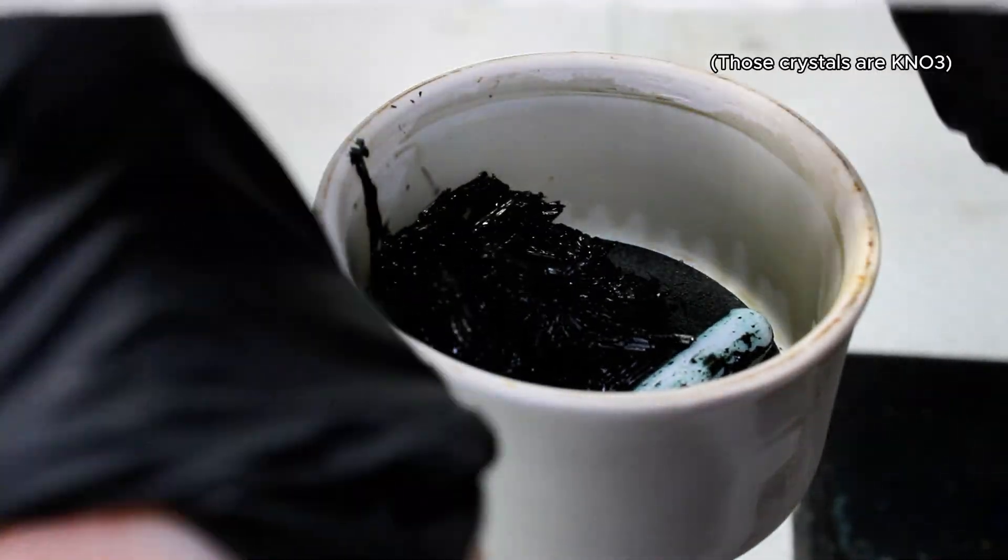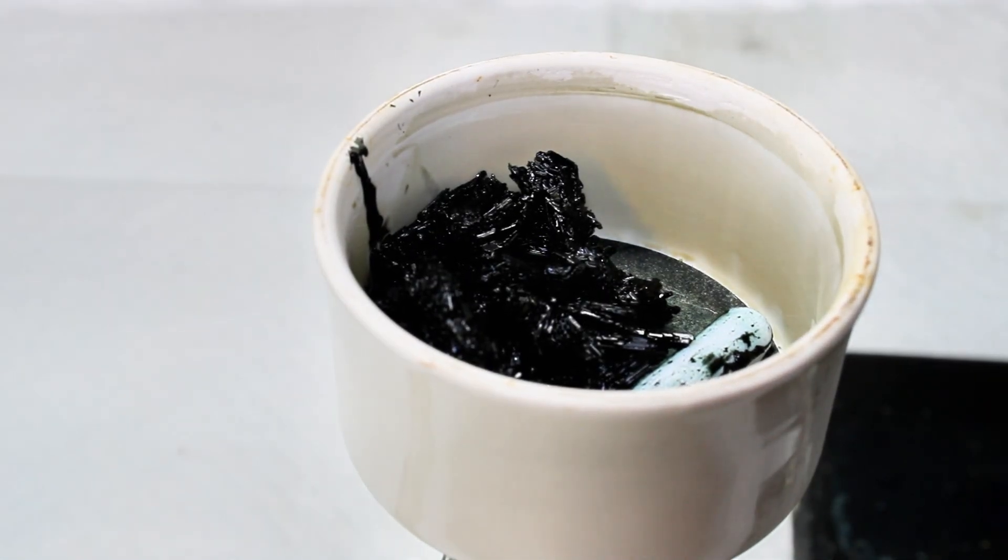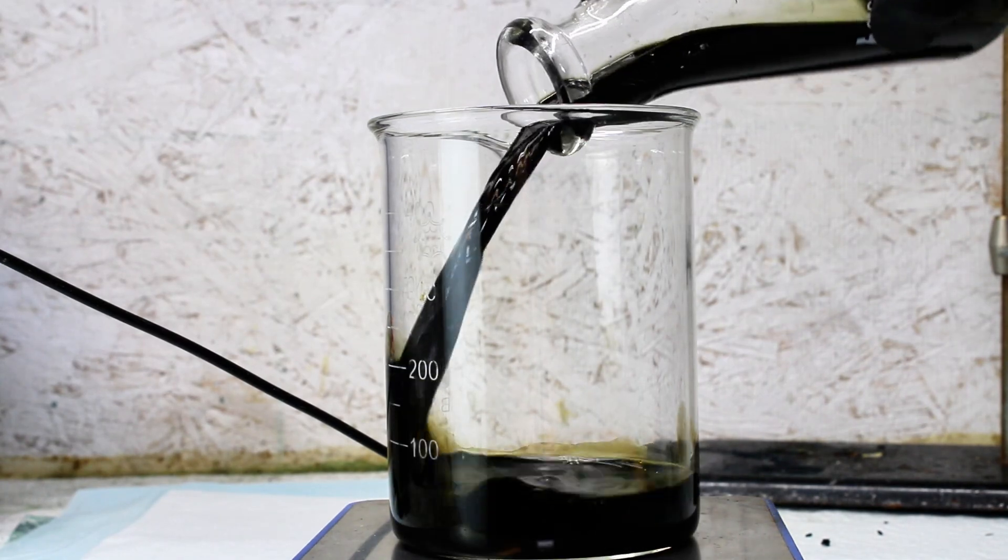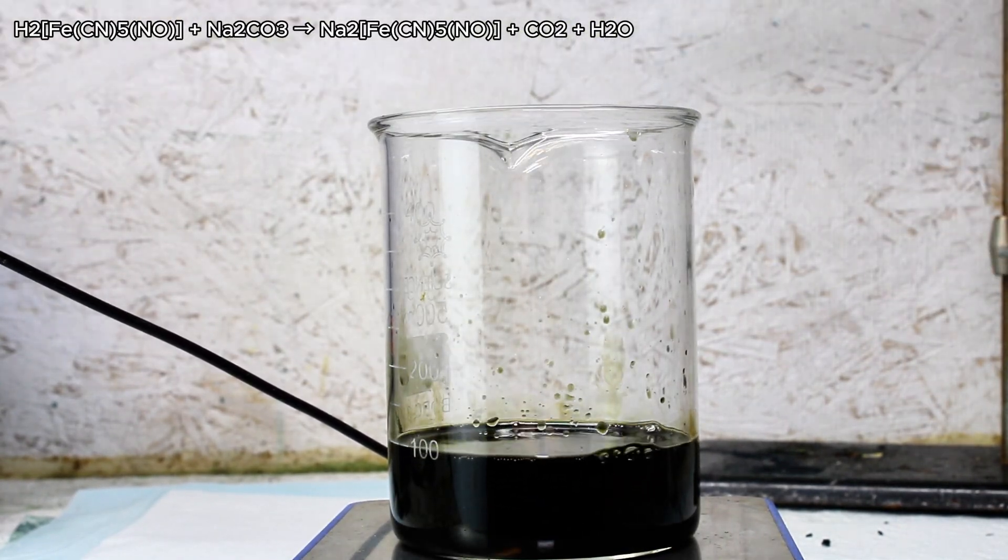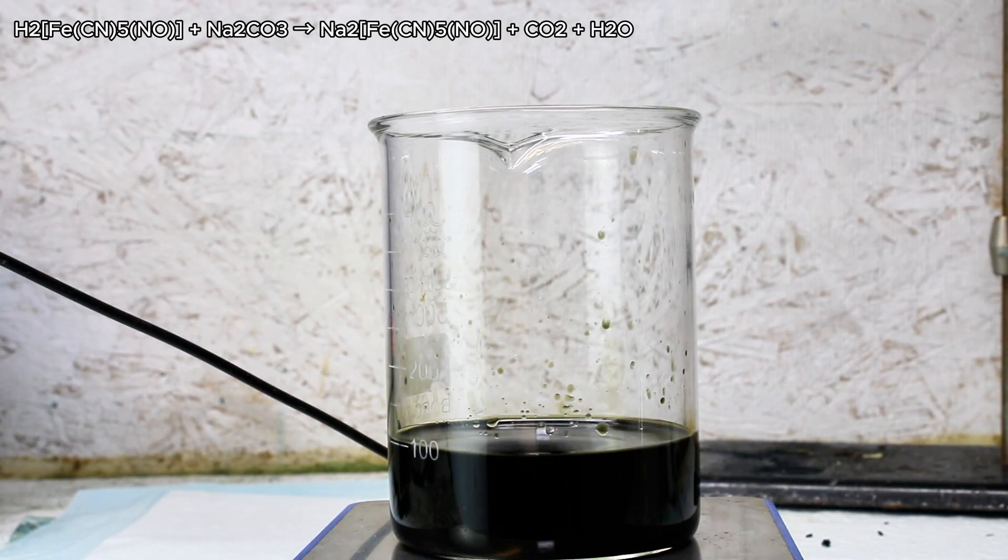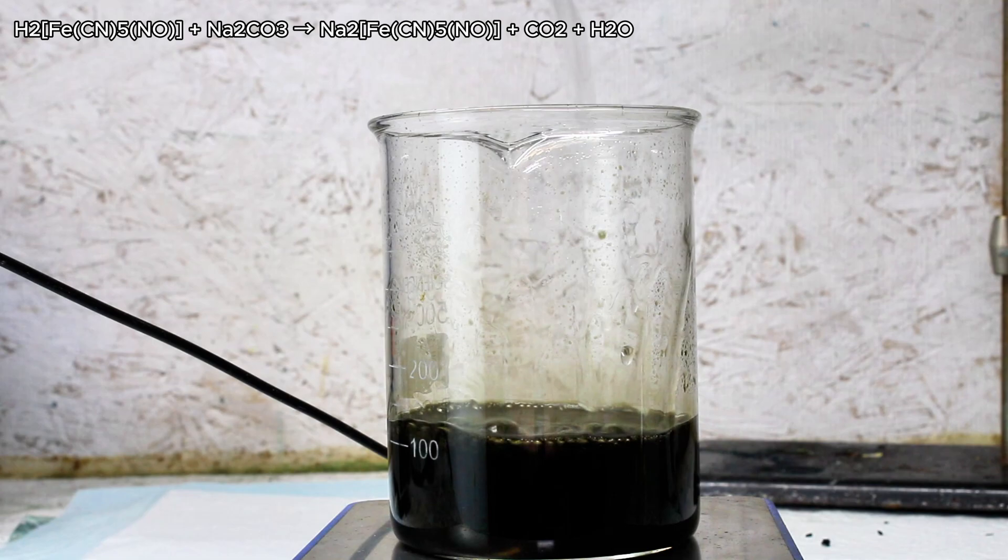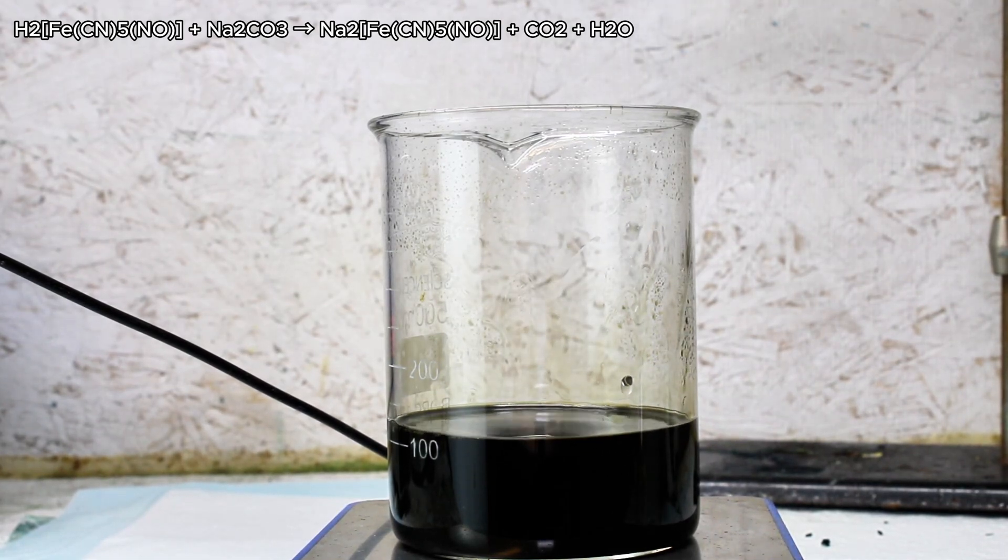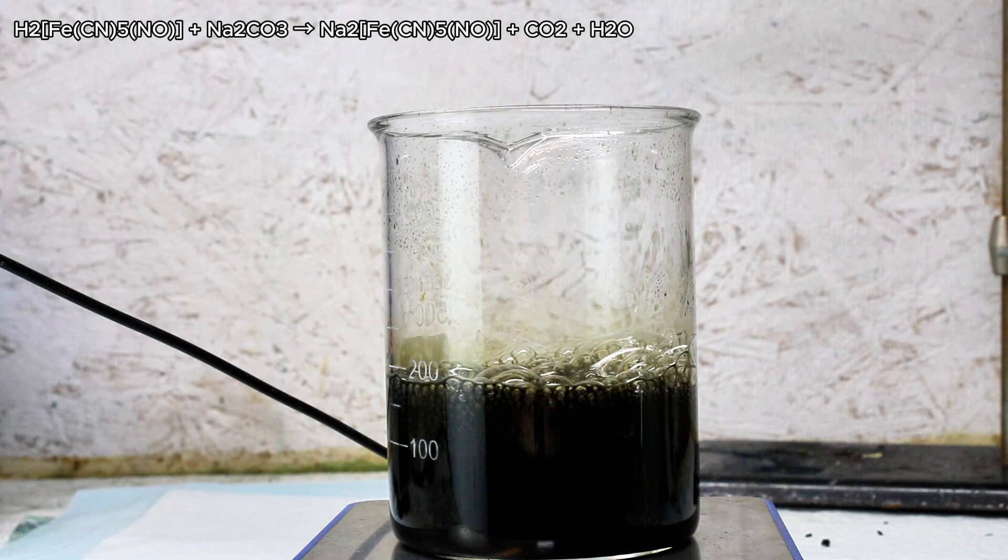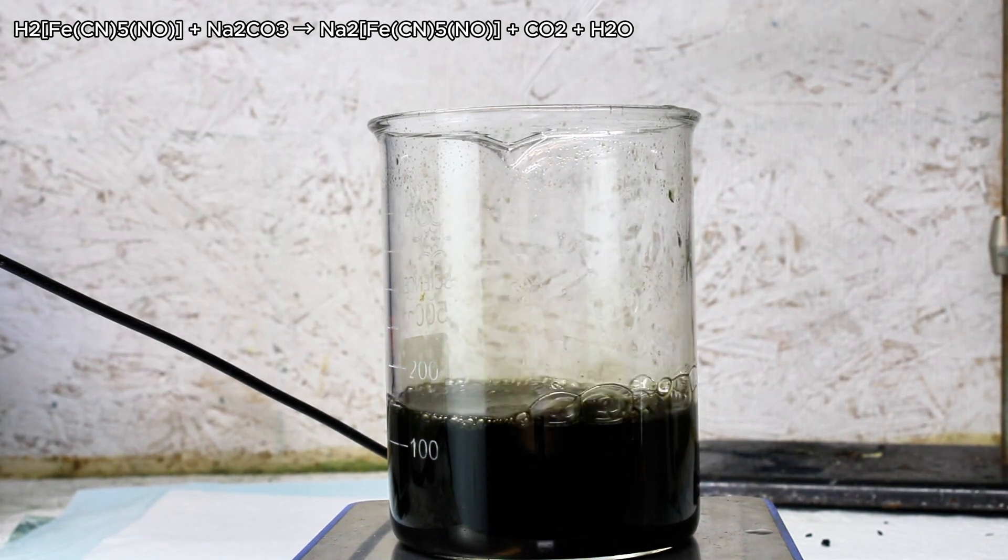I then transferred my filtrate to a beaker and slowly neutralized it with a saturated solution of sodium carbonate. This reaction will result in the formation of my sodium nitroprusside along with carbon dioxide gas. Sodium nitrate is also formed by reacting with excess nitric acid, and I'm sure there's a few other side reactions going on here with my unknown byproducts.